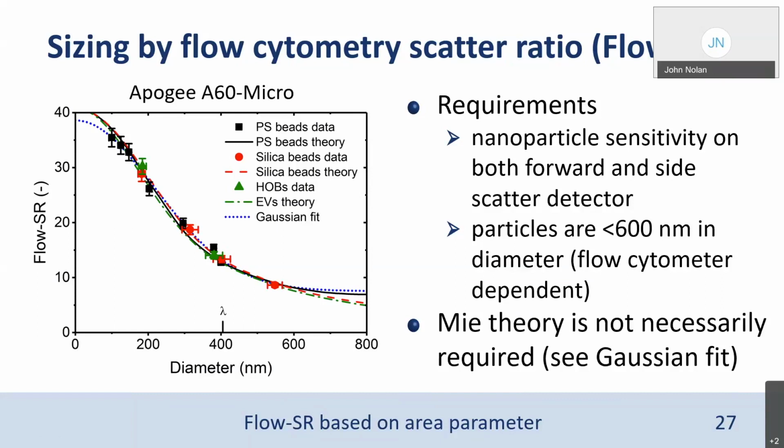Okay, next, another practical question. Ben asks, what are the best options for standards currently? I presume he's talking about light scatter standards. What beads do you use for this? Which beads do we use? Does it make a difference?